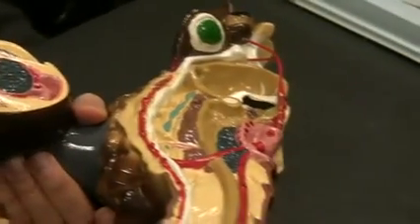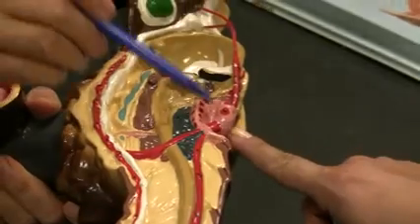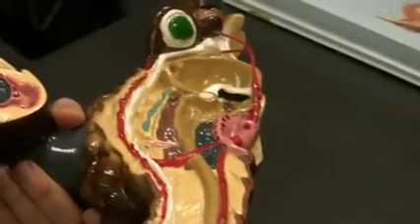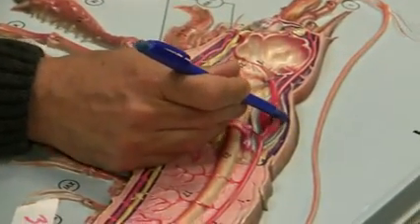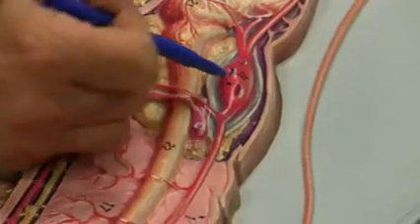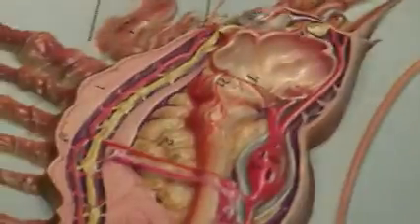Can you show the heart on that one again, please? Heart would be on this one, right here. On that one? This one is the heart. Again, you can ask about the pericardium. Pericardium is not clear on this one. Let's try. I want to show you a nice pericardium. You have pericardium right here, heart right here, and open circulatory system or closed circulatory system? These guys, open circulatory system.